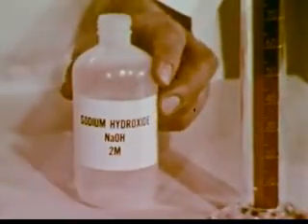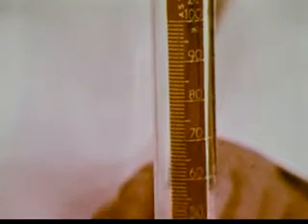The second reactant is a water solution of sodium hydroxide. It too is measured. The sodium hydroxide is then added to the reaction flask.